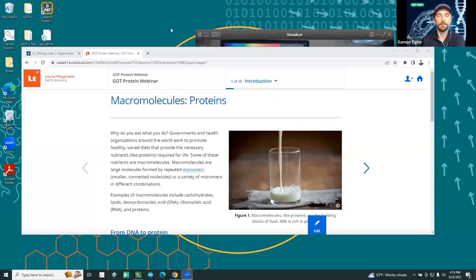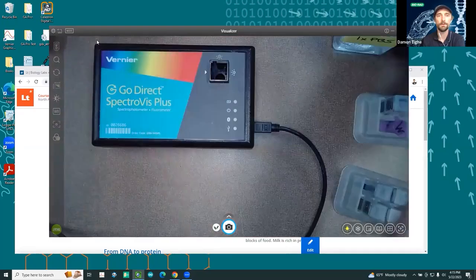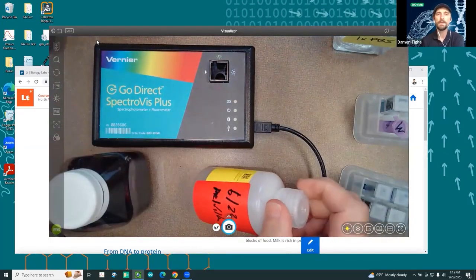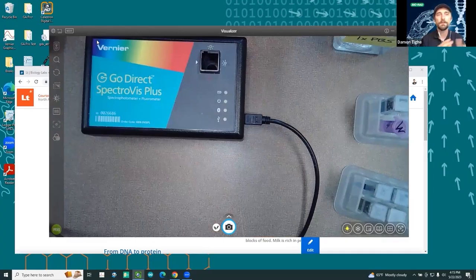And while John sets that up, one thing to know is John today is going to be using reagents that are a year old. And this brings up a really nice thing about most Bio-Rad kits: we guarantee everything we send you for 1 year. The Bradford assay is very, very stable, especially if you store the standards within a refrigerator. We guarantee them for a year, but they easily have a longer shelf life than that. If those questions ever come up, like, I've got this kit and it's been sitting around a little bit longer than your guarantee, you can always send me an email and I can tell you, you know what, this is probably more of what you expect the shelf life of this to be. You're good, or you're not good on that.